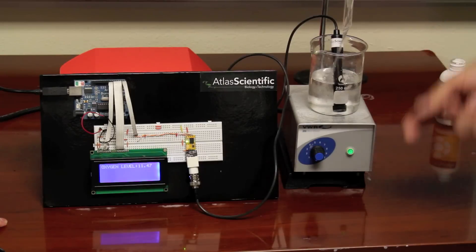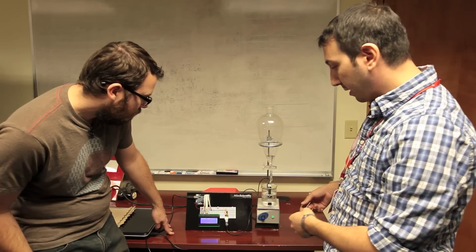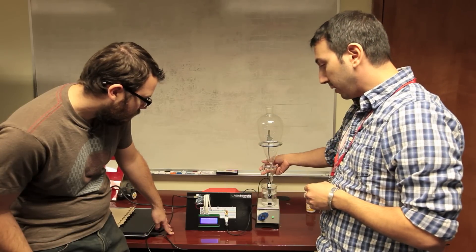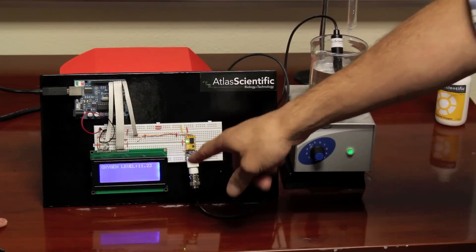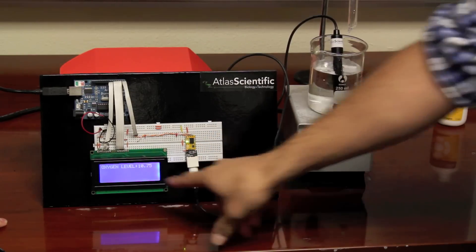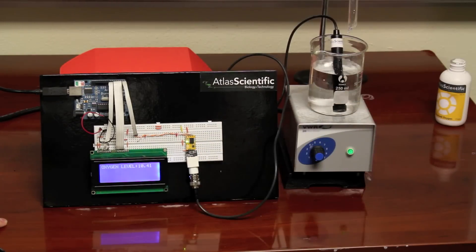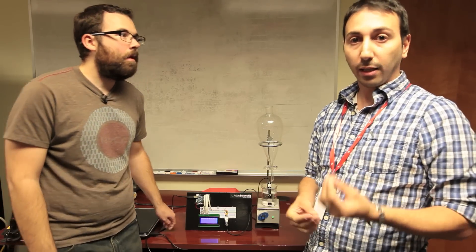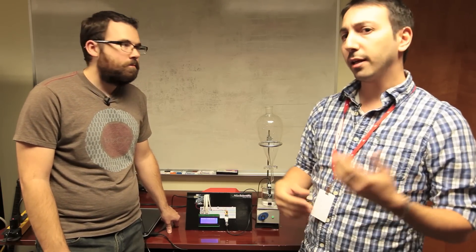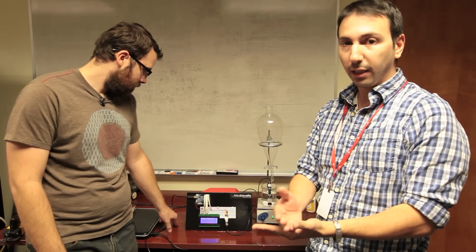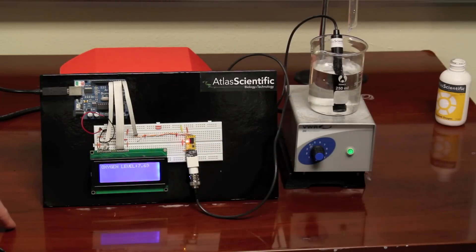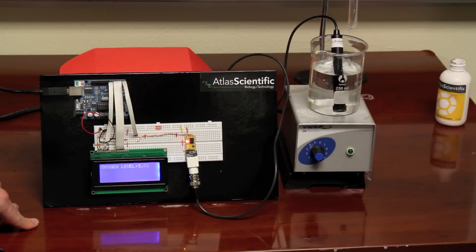And so we provide a zero DO solution. And now what we're going to do is actually pour that in just by opening the valve here. And as it goes in, even though it's falling through the air, even though it's mixing, in a few seconds you'll start to see the oxygen level start dropping. And there it goes, 10, now it'll just keep going down. The thing about dissolved oxygen is the answer doesn't come immediately. It takes about one to three minutes to get the exact answer. And that's what's happening here. You can see actually now it's falling quite rapidly. It's almost to six. And it's just going to go all the way down to zero. I can shut the mixer off now. It's well stirred. And the chemical that we put in is just eating up all the oxygen in the water.